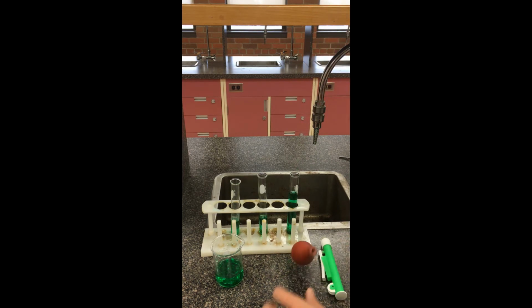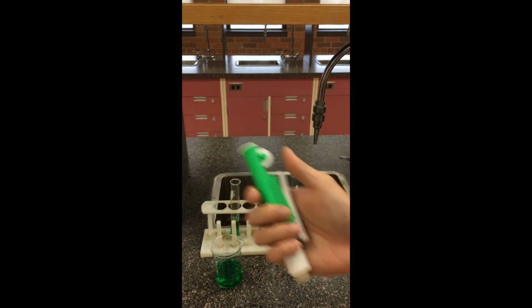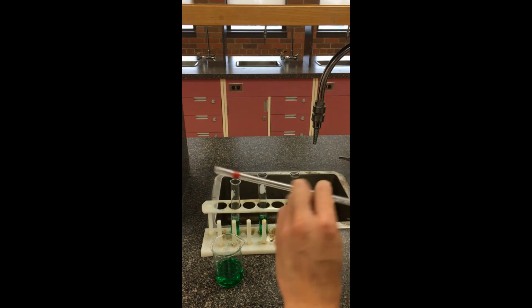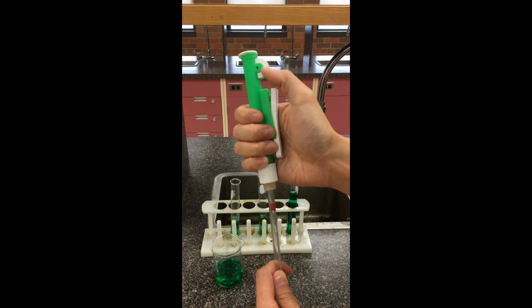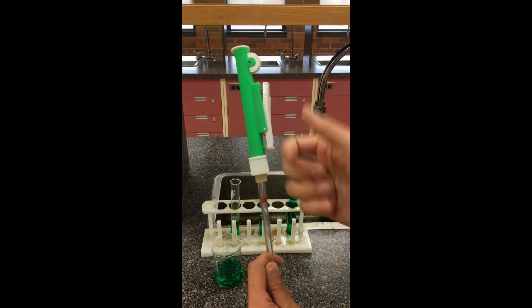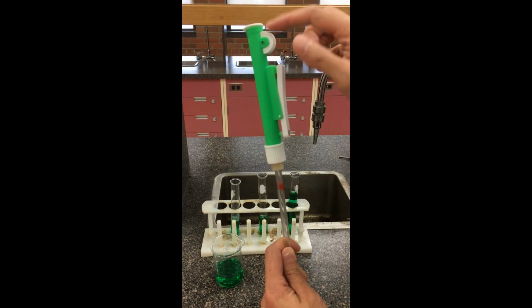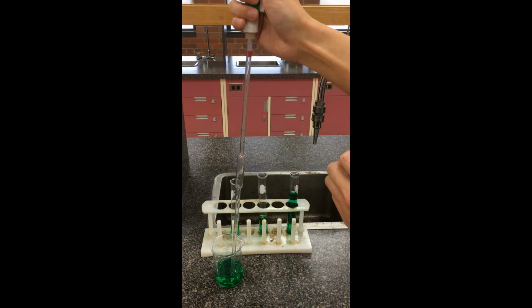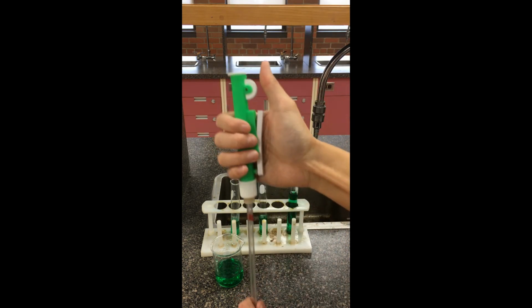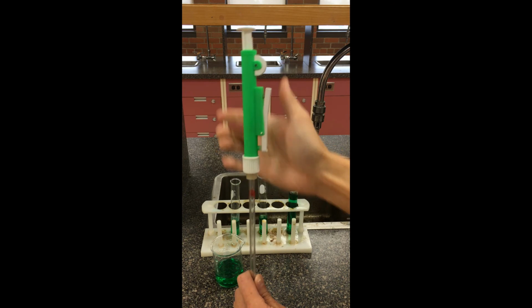Sometimes people have trouble with these suction bulbs. So what we can do is use this sort of engineered suction device here. Let's go back to my 10 milliliter pipette here. I'm going to form the seal here. This time for this green device here, it's actually nice, you don't have to pull it off. So you just have it in the starting position here. Keep the open end underneath the beaker at all times. And this time what you're going to do is dial this wheel. As you dial this wheel here, that's going to provide the suction. That's actually going to pull the solution up.